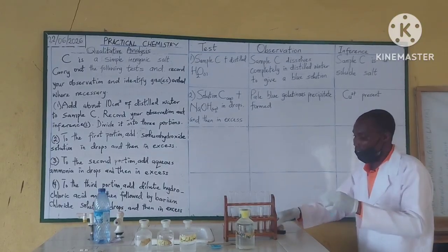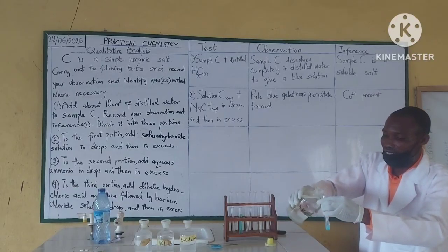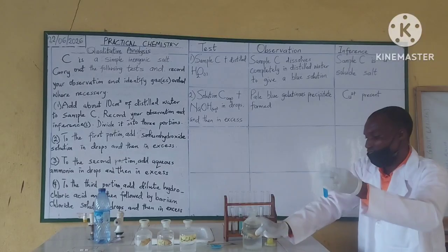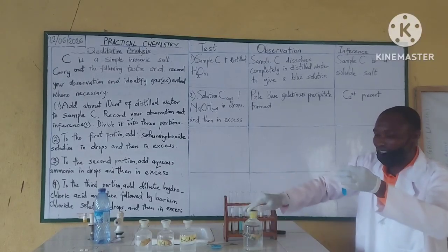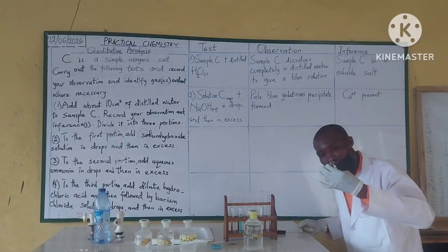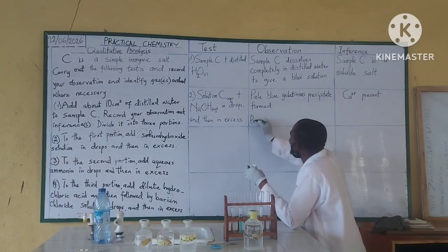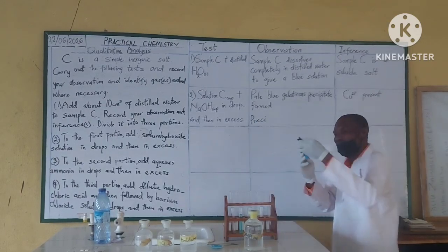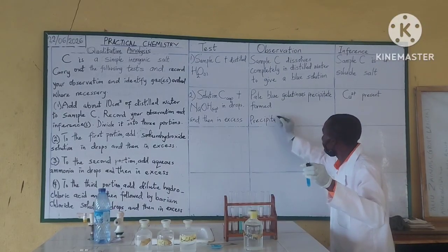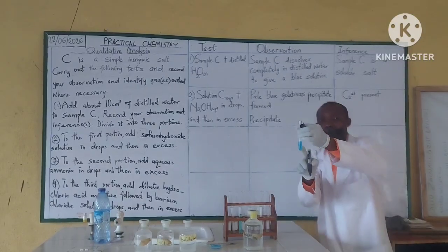That is in drops. Now in excess, what do we have? Let's now add in excess. What happened to the precipitate? When you add it in excess, the precipitate does not dissolve.